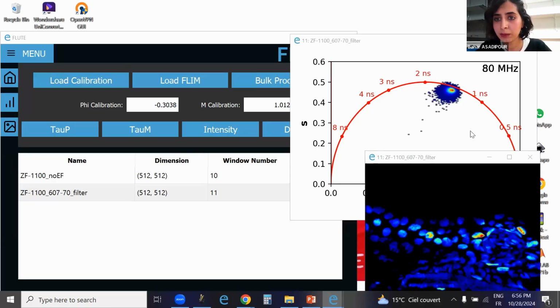Okay, I think the confusion I am having with the distance analysis is that there's no numerical value, and I am not really sure how to obtain a numerical value for quantitative analysis. Numerical value for your line, you mean? Okay, so you have to extract that from the text files that you get.